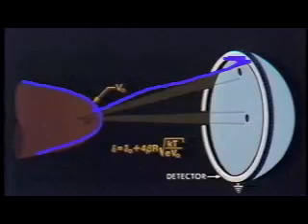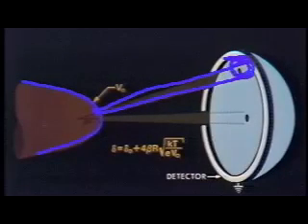So if we have many ions created over the same region of the surface in time, we'll form a little area on the screen of contrast, a little disk of confusion that will get smaller as the transverse velocity component of the ion gets smaller. So we simply get better resolution by cooling the surface of the specimen and thereby cooling the gas.